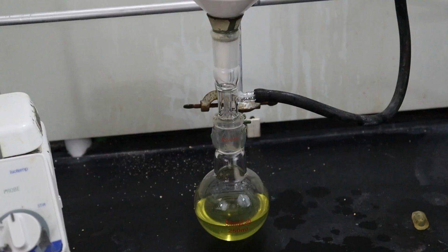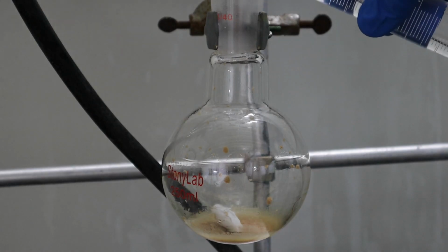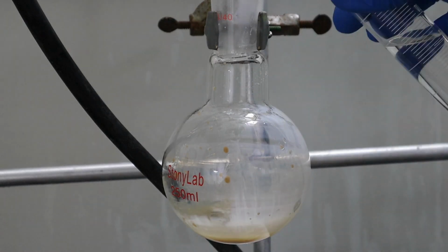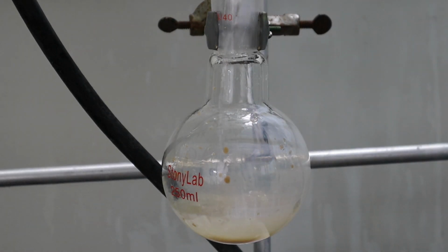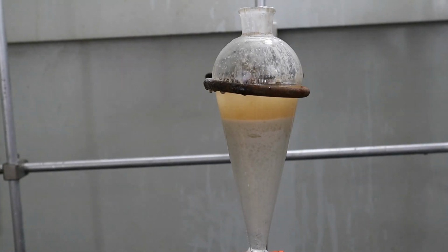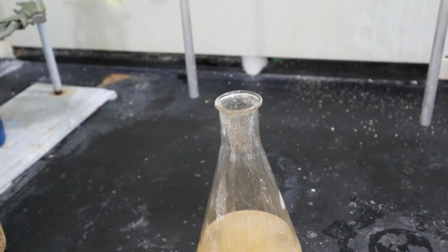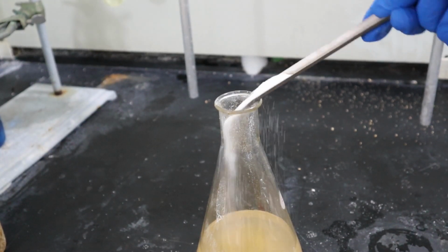I rotovapped off the excess methanol. The residue was dissolved in a mixture of water and diethyl ether. There was a white precipitate that dissolved in neither, most likely titanium dioxide that got through the filter earlier. This clogged the funnel and made the liquid-liquid extraction difficult. I dried the ether extract with anhydrous sodium sulfate and removed the ether with the rotovap.